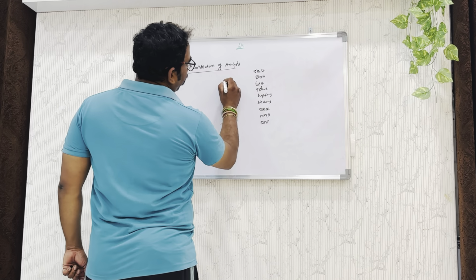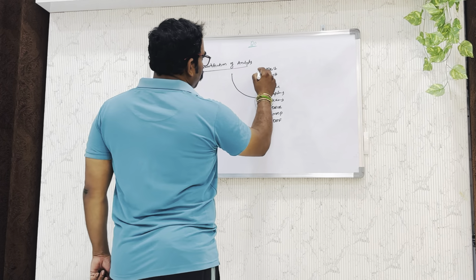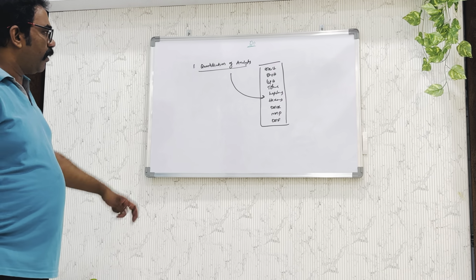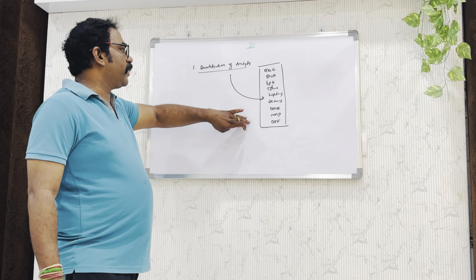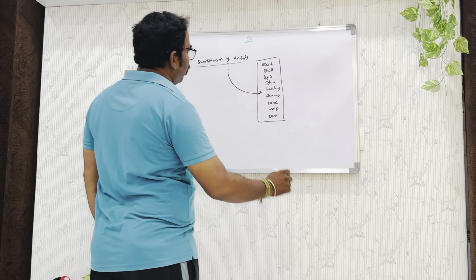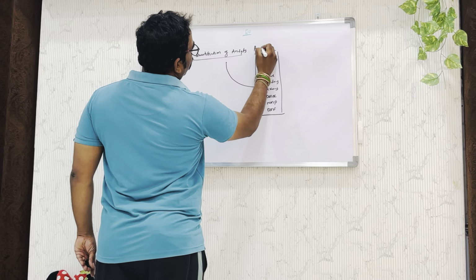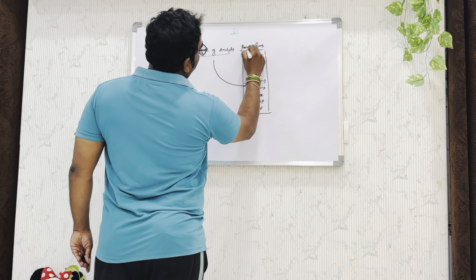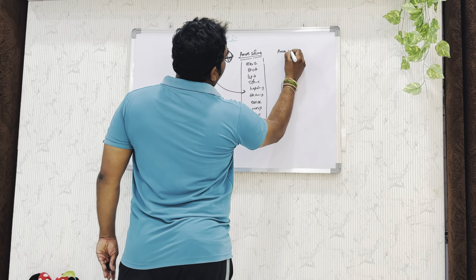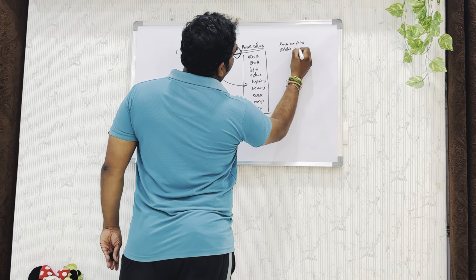Whenever we are quantifying these solvents by GC, we need to show the control as per regulatory requirement. Along with this, what are the possible contaminants that will form during the manufacturing process from these solvents? That is also very important. For example, these we can consider as process solvents. Now it comes to process contaminants, or possible contaminants.